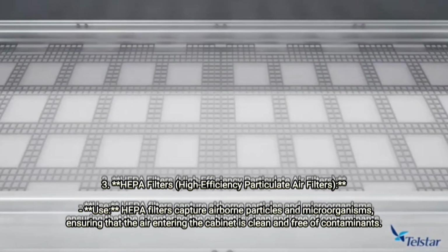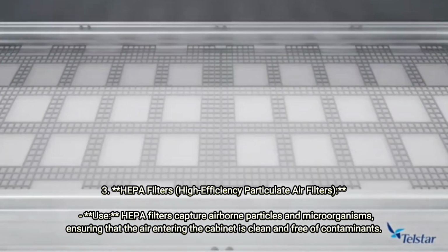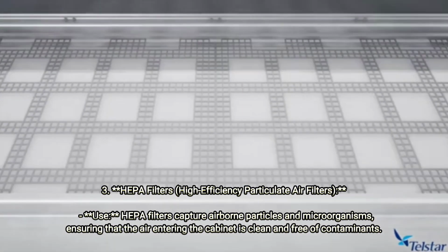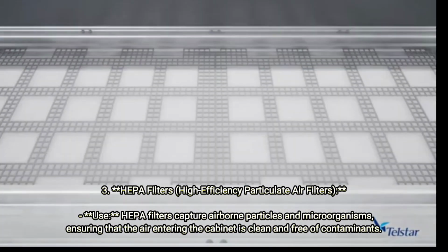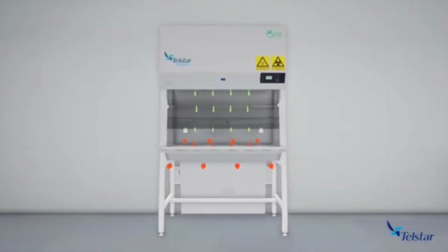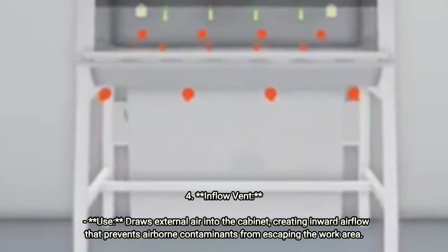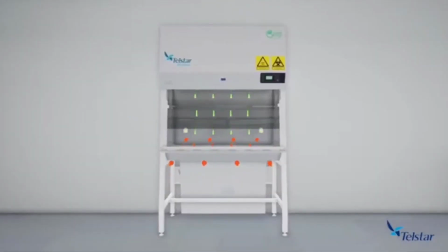Third, HEPA filters or high-efficiency particulate air filters. HEPA filters capture airborne particles and microorganisms, ensuring that the air entering the cabinet is clean and free of contaminants. Fourth is the inflow vent. It is used to draw external air into the cabinet, creating inward airflow that prevents airborne contaminants from escaping the work area.